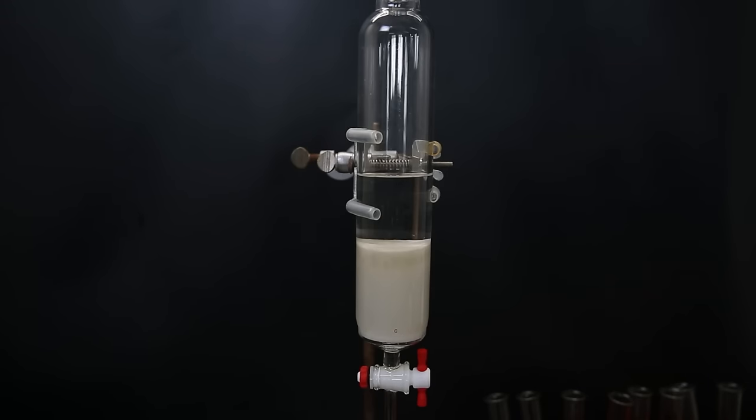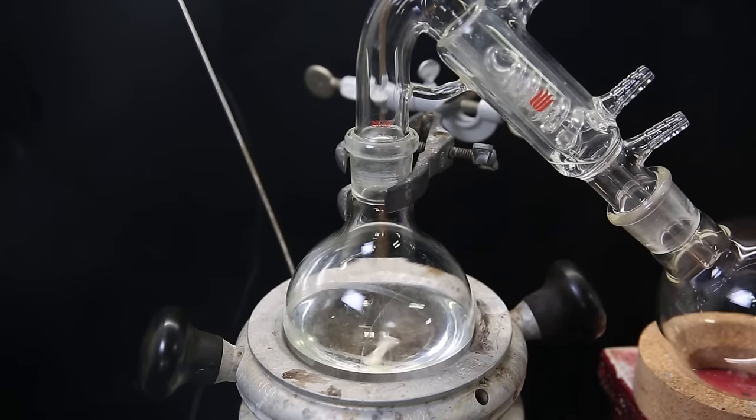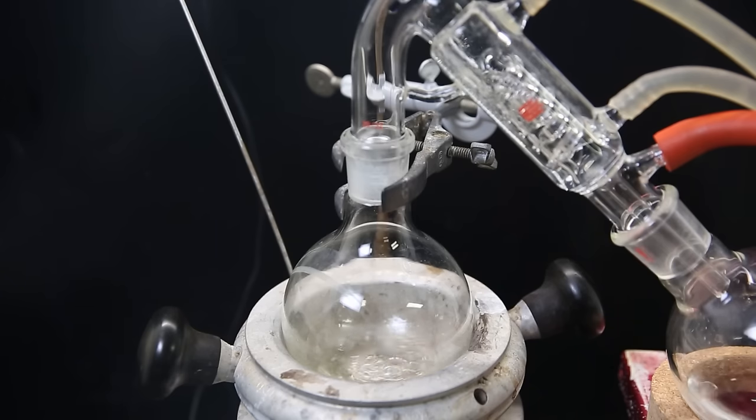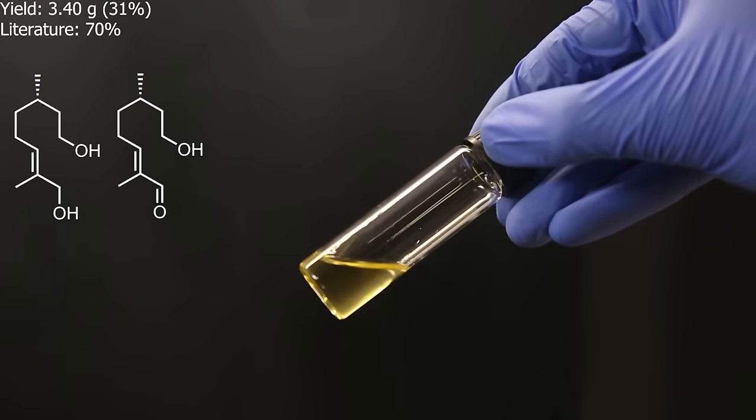I ran the column with this mixture until pretty much all of the impurities had come through, and then switched the mixture to 75% ethyl acetate in hexanes to get the products to come through. I then take the fractions that contain the product and put it all into a flask. I set it up for short path vacuum distillation to remove all of the solvent, and afterward I am left with 3.4 grams of a yellow oil, which is a yield of 31%.